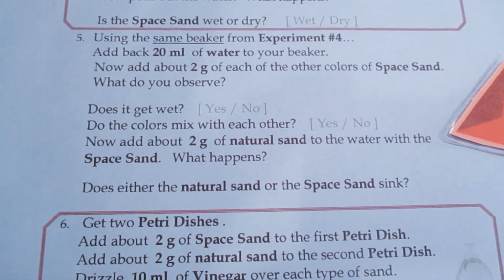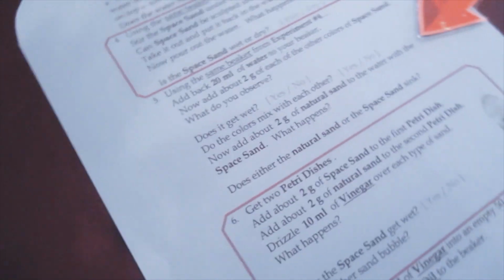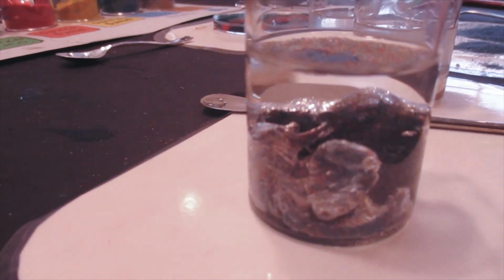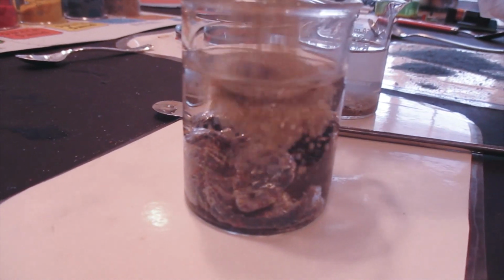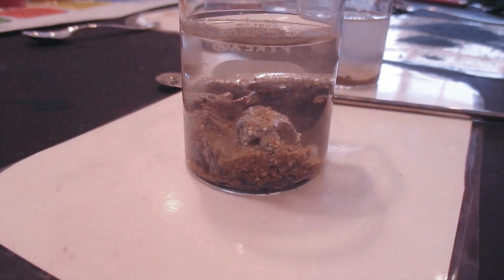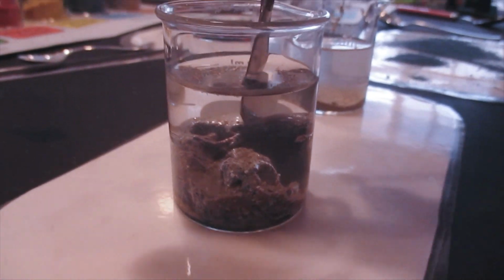And I think, okay, so now we're going to add the natural sand. Go ahead and put a scoop of natural sand in there, Lucy. And we'll see if that mixes. Try to mix that in. Use this other stir rod. This one's a good one. Hold the beaker and stir it really well.